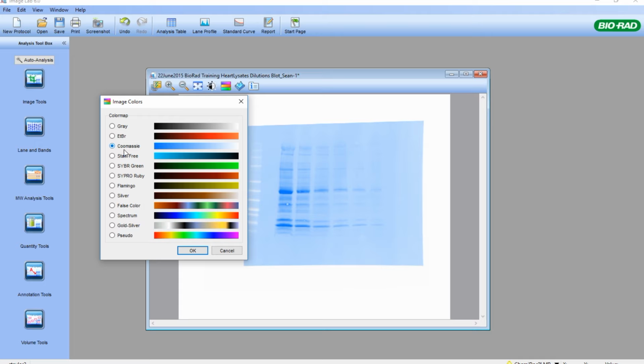Now, of course, the densitometric data doesn't change in the image, but it would likely be preferable from a journal to receive the image itself in the native color settings of the camera. And given that all the cameras are grayscale, and purposely grayscale so that they can measure the shades of density of bands, it's probably preferable to leave images in a grayscale format for publication.